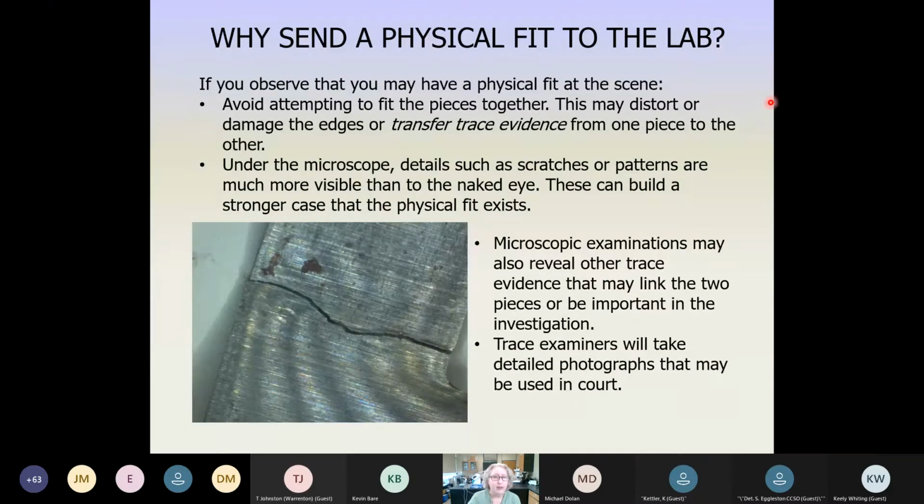And you can see there's a little bit of apparent blood here, this red-brown material. And the second portion beneath the break is the handle of the knife, where it was in the hilt or the tang of the knife itself. So if you're at the scene and you're trying to take that handle off the suspect, or it's been recovered and now you're just placing it together with the part from the skull, any DNA that's on one could potentially be transferred to the other, even though it wasn't really there at the scene. You've just mixed them up. So please avoid doing that.